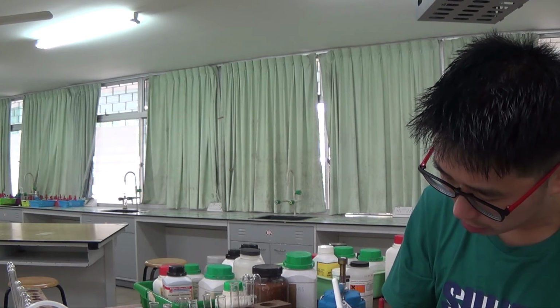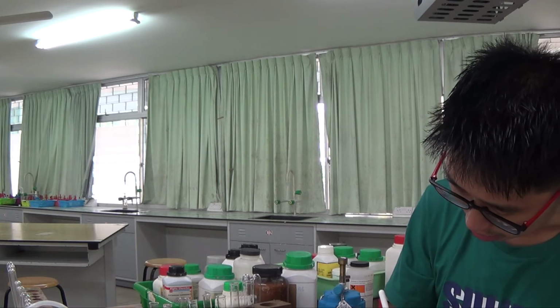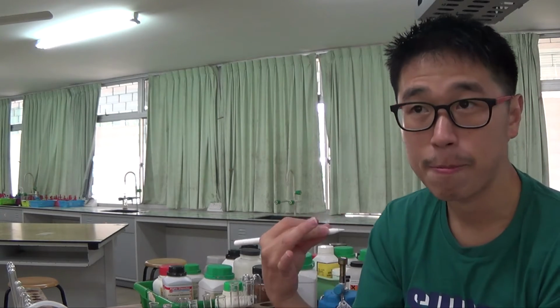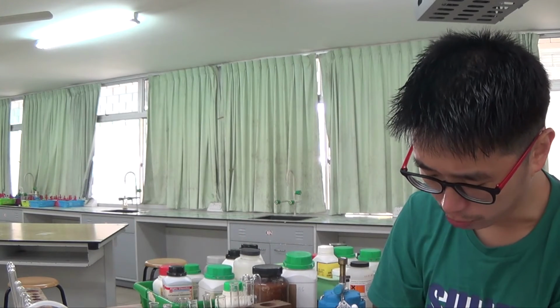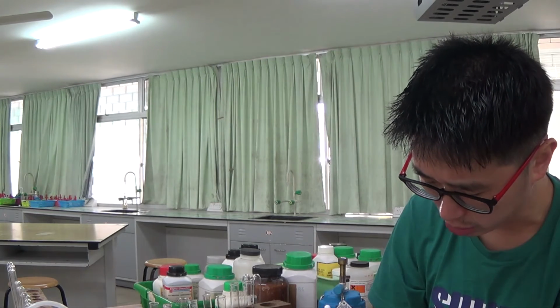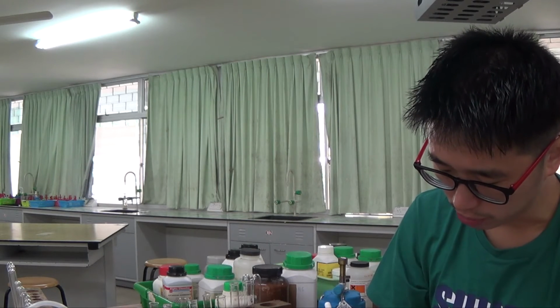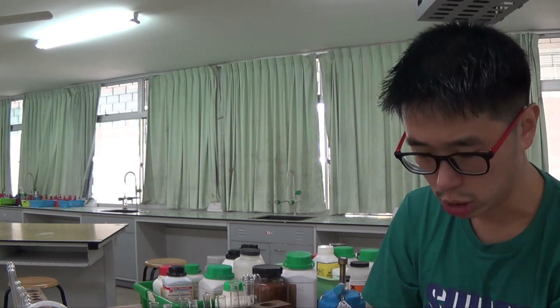This is a solid, a white precipitate, but then in excess NaOH, this is actually part of what makes aluminium oxide, not hydroxide, aluminium oxide amphoteric, because this thing can react with excess hydroxide. This is a solid, this is aqueous, and we saw that it dissolved, right? What does it dissolve into? It will give you 4 hydroxide. Aluminium with 3 hydroxide, the charges balance out.